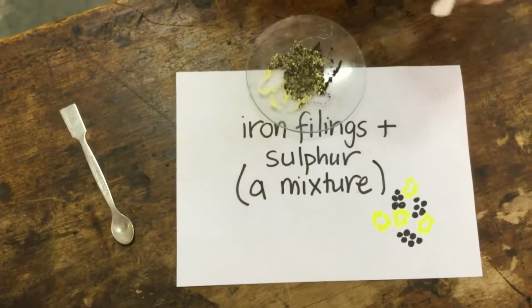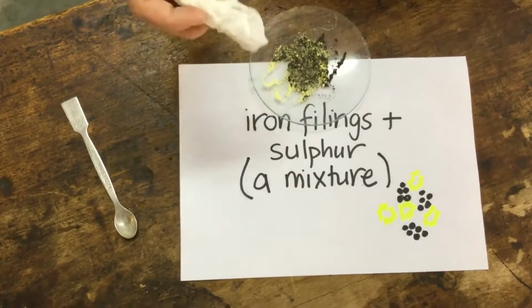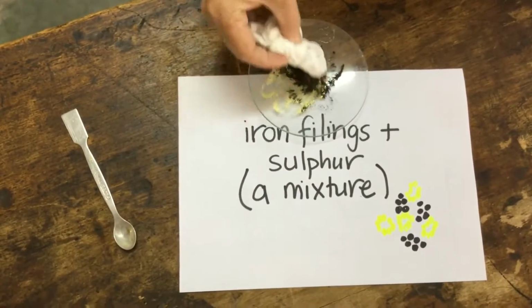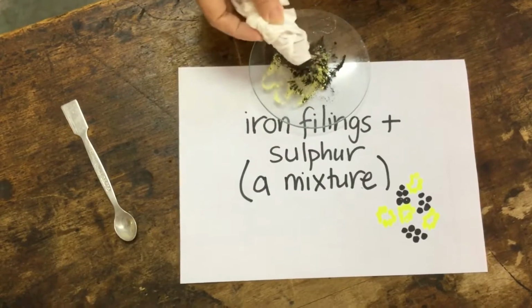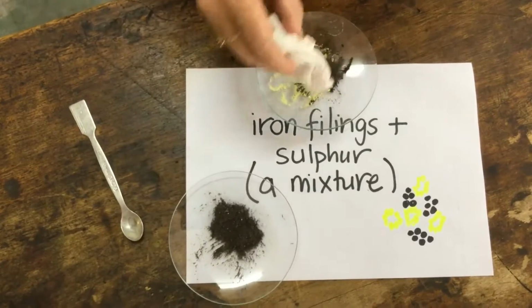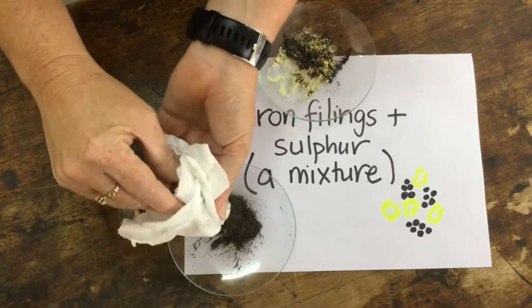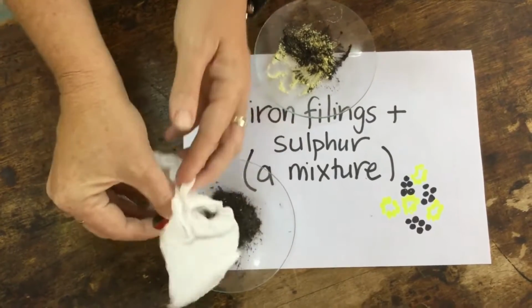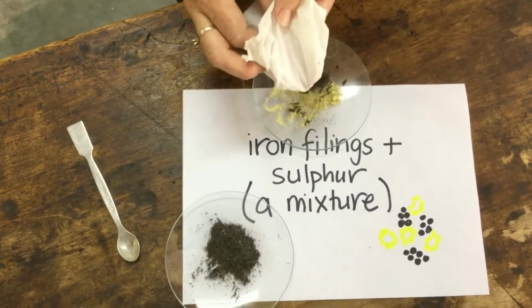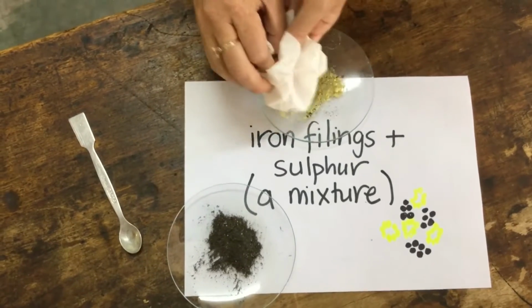And I can show you that in a mixture, these are not chemically combined. If I bring my magnet, again wrapped up in my tissue, nearby, you can see that I can separate out these iron filings. I can separate out the iron filings, just get the magnet out, drop them there, and separate some more iron filings, clean them off, drop them there, and separate some more.